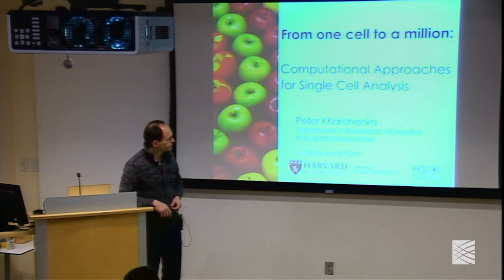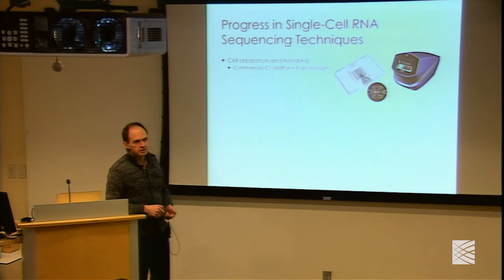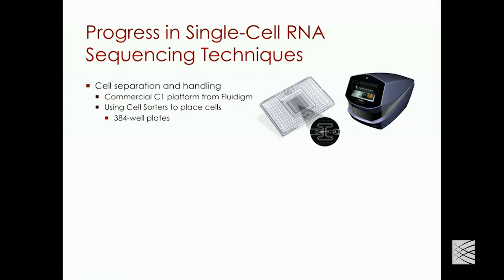Okay, so usually I start with an introduction as to why do single-cell analysis and how people approach this, but I'm sure the audience here is very familiar with this. But just to emphasize the amount of progress we've had in just the past few years, it seems like ancient history, but it was just a couple of years ago that this was the prime machine, right? And so we went from this 96-well microfluidic system to, well, plate systems have been used for a while already. They've advanced quite a bit in terms of quality and a little bit in terms of scale.